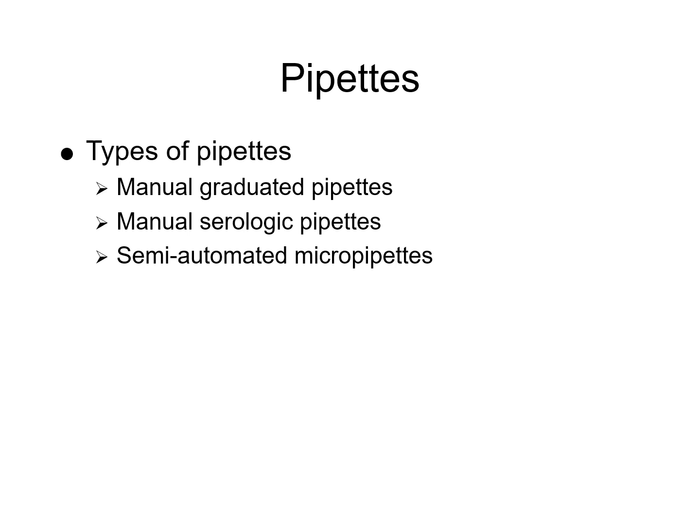So pipettes, there are different types of pipettes that are used. The purpose of this is to understand the different types of pipettes used in serology laboratories. This will help to ensure accurate measurement and transfer of liquids during the assays.